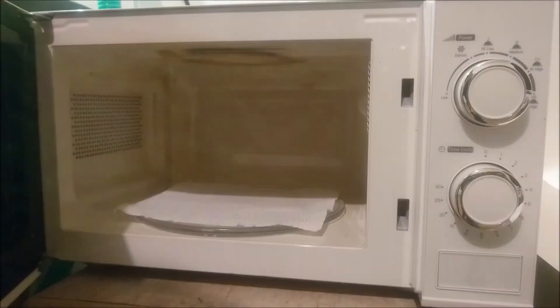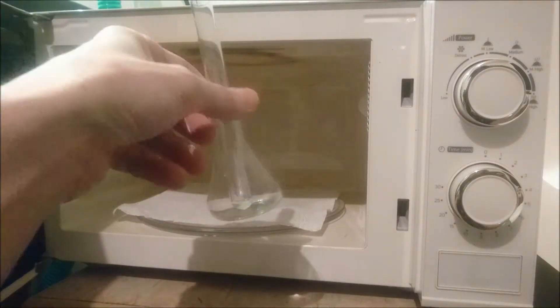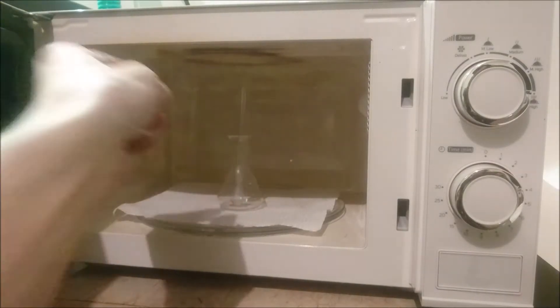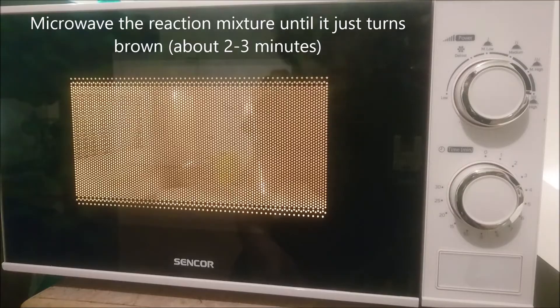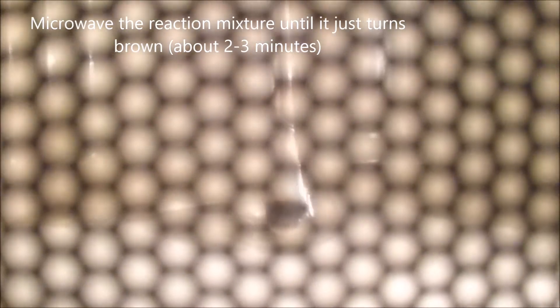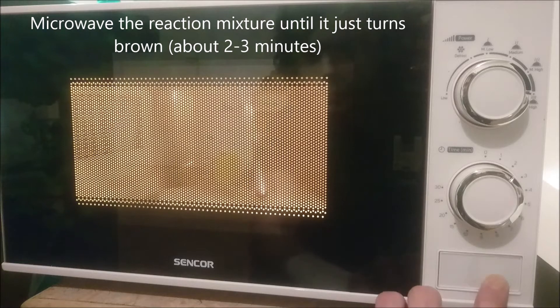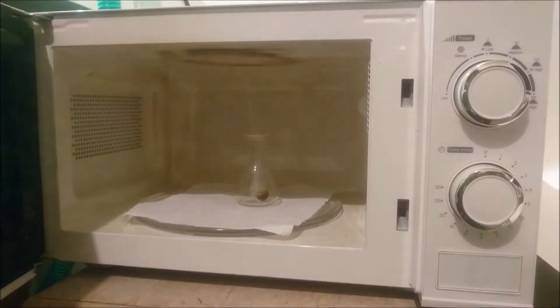Place the reaction mixture in a household microwave oven and heat on full power. The mixture will froth a little and gradually turn darker. Stop the heating when the mixture is dark brown and the frothing mostly subsided. This usually takes about 2-3 minutes.